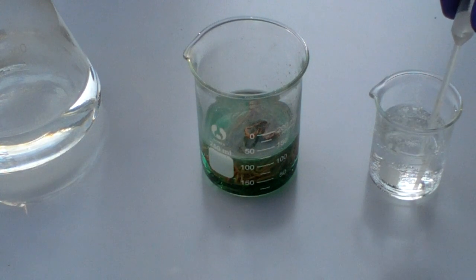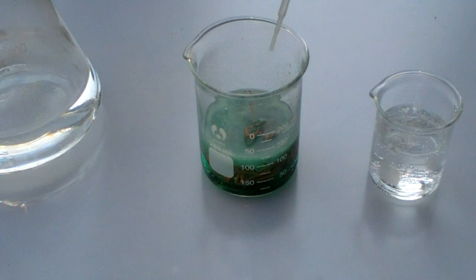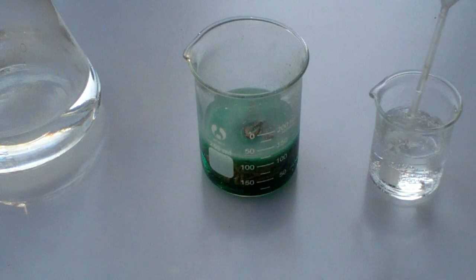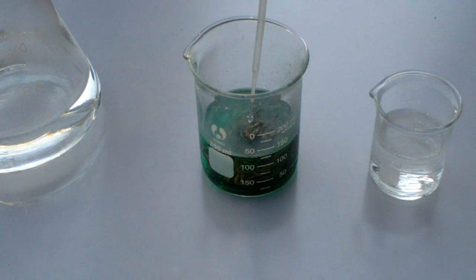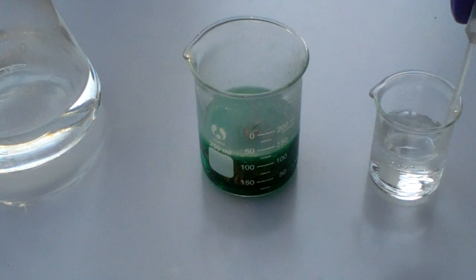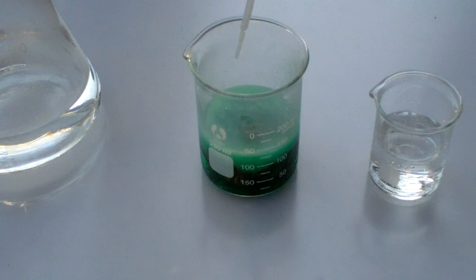You can see bubbling and a solution going a clear green color. That is what is to be expected. There is also some fuming going on, and that is most likely hydrogen chloride gas being evolved. So be careful not to breathe that in. And I'm just going to keep on adding hydrogen peroxide until it stops bubbling.